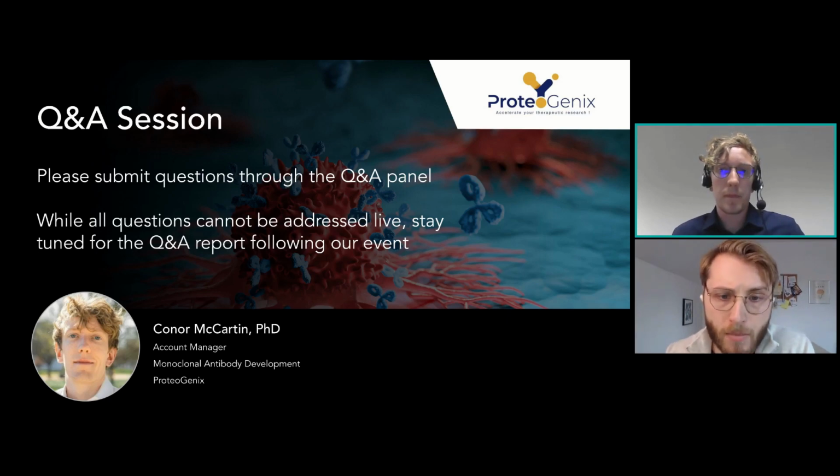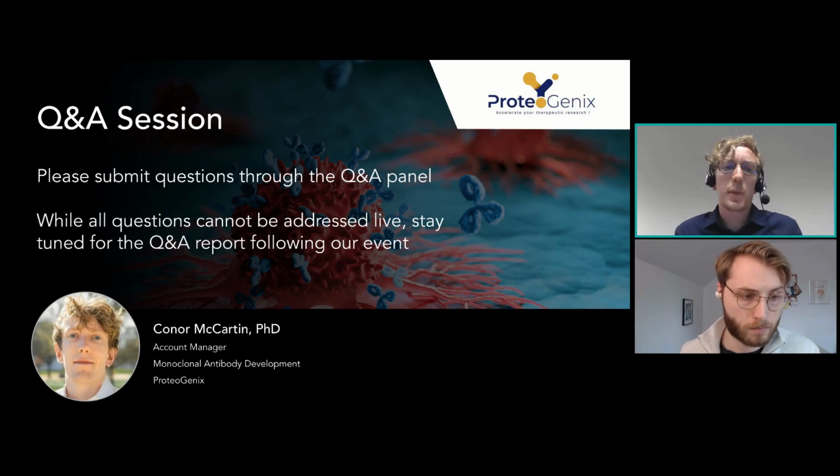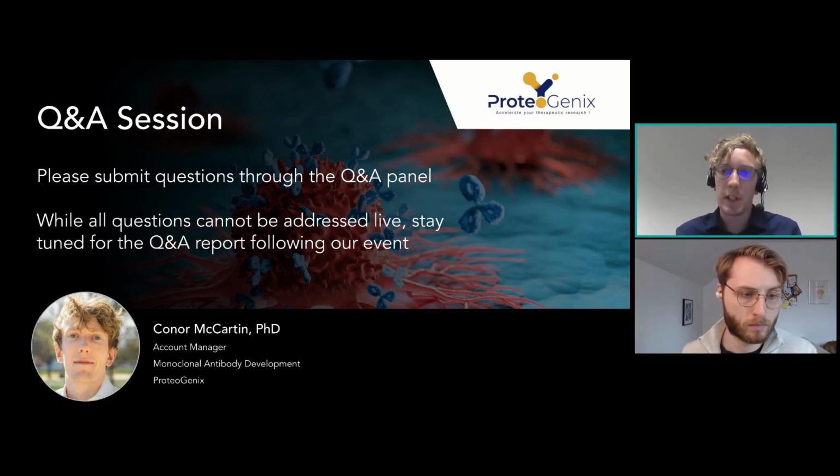Fantastic. And how do you properly coat peptides or small molecules for panning? So for the coating of small molecules, coating them themselves is not very efficient due to the lack of adsorptive interactions. So for this type of project, we always conjugate these to some protein carriers, which will allow them to be effectively coated. And in those cases, to avoid enrichment of binders against those carrier proteins, we will do several different ones, which we will then change over the rounds to avoid enriching against them.